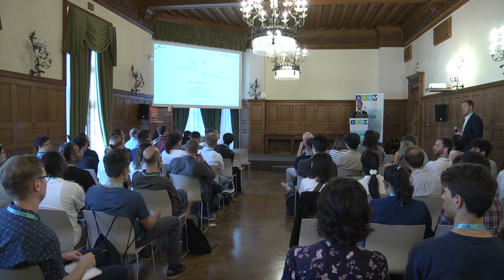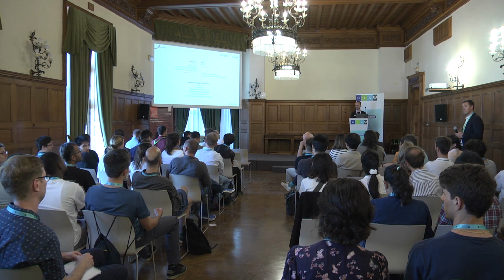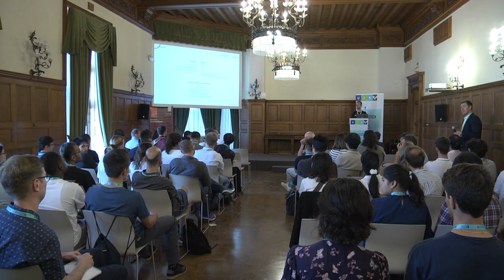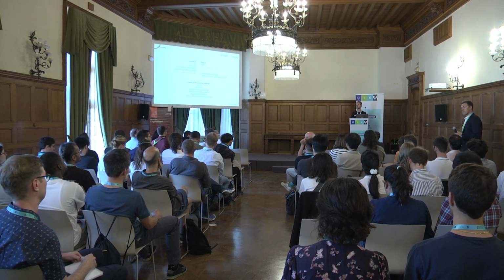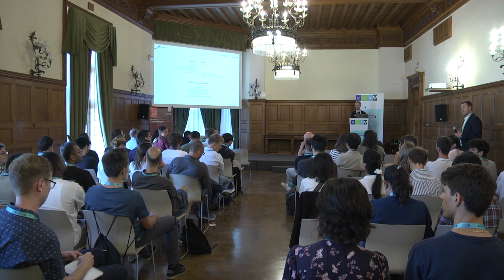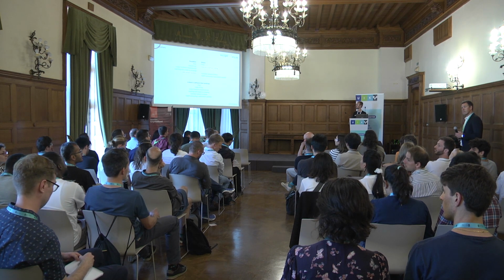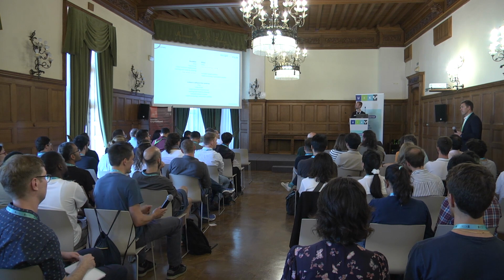There is this Fourier filtering, but to analyze the Fourier spectrum, to find the k-vector and effective mode index, that's not really close. And to do fitting, exponential fitting. So that's definitely something where you need to use some other software. But since here there are many students, my advice would be try to learn both. Why not?